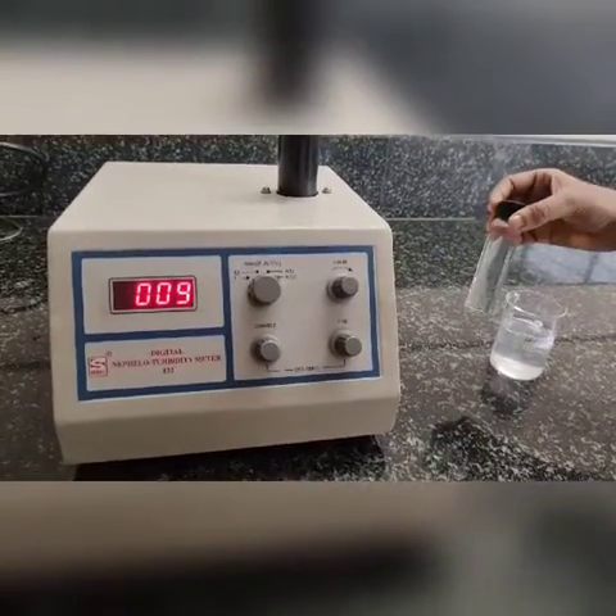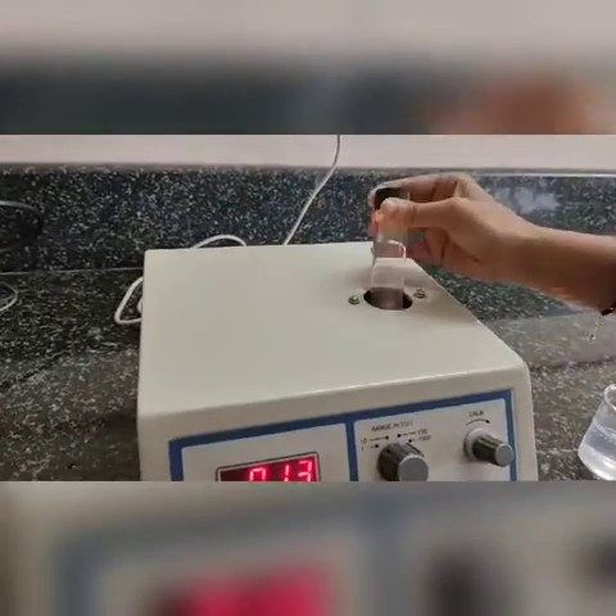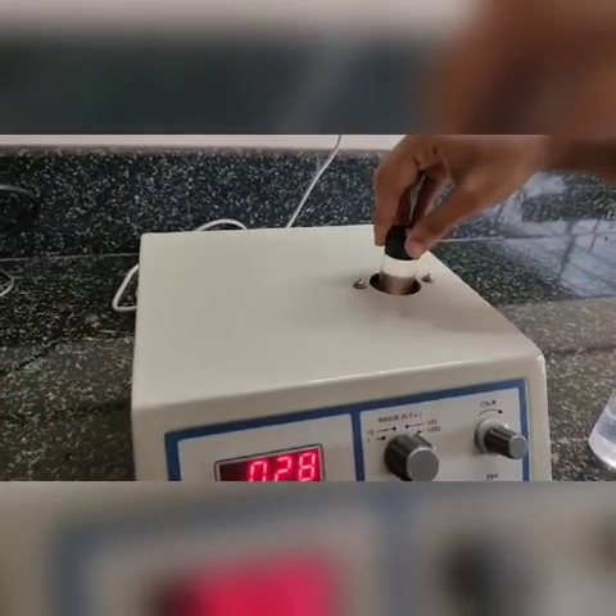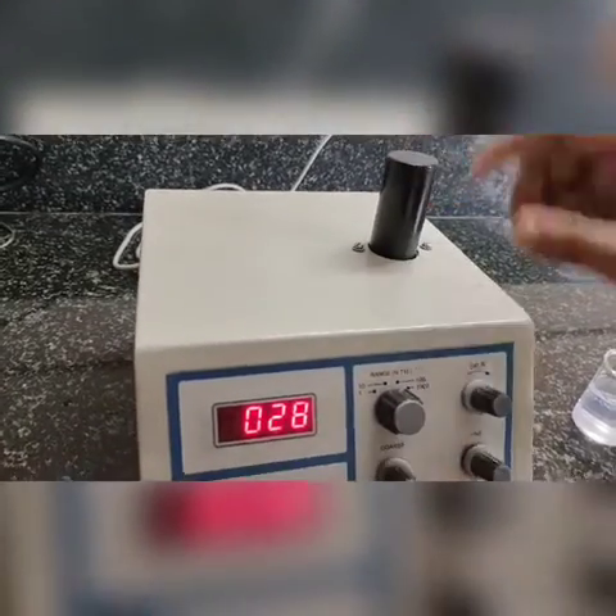For sample analysis, fill the sample in the bottle and place it inside. Coincide it with the line and directly note down the reading.